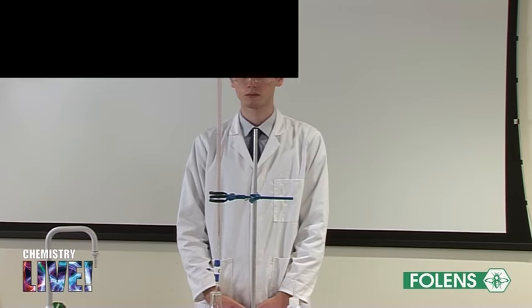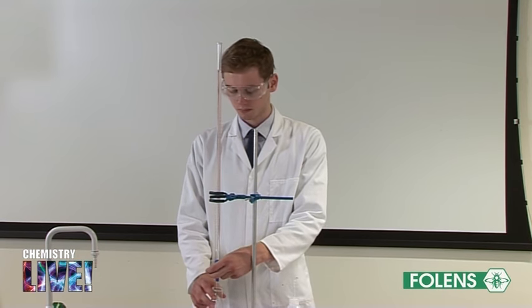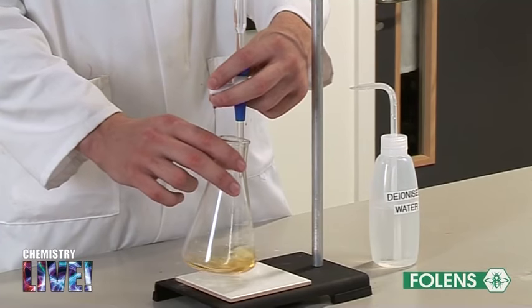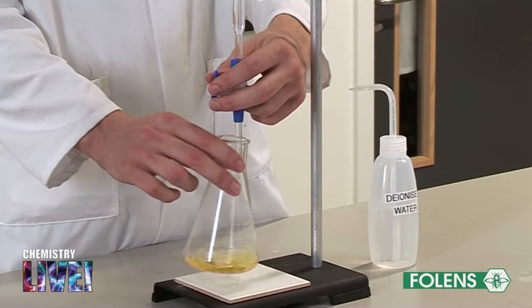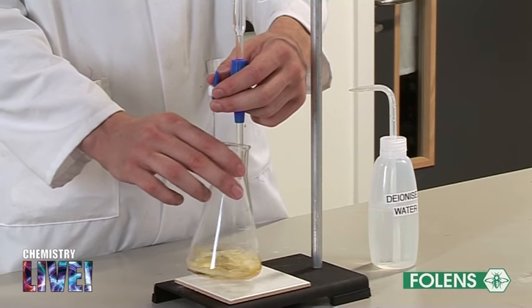Now we are ready to carry out the first accurate titration. We know from the rough titration that the end point is 24.1 centimeters cubed. As we near this end point, we will add the hydrochloric acid drop by drop.